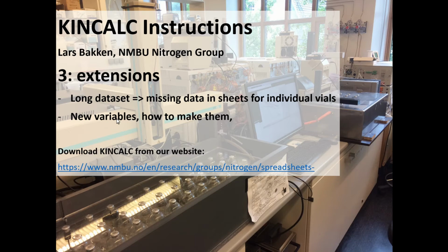The first example I will use is a leakage test that was conducted recently by Lars Molstad, where we had a very large data set, very many measurements in each vial, and we need to extend the number of lines in the sheet, and I will show you how to do that.